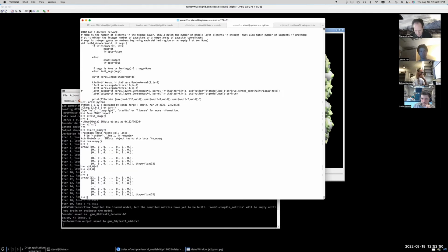And now if I look at B, you'll see that first value changed to 2 immediately. So I can do that in both directions. But if I modify the NumPy object, the EMAN side won't know that it has changed. So the statistics of the image and stuff.